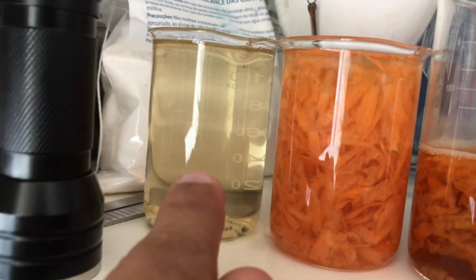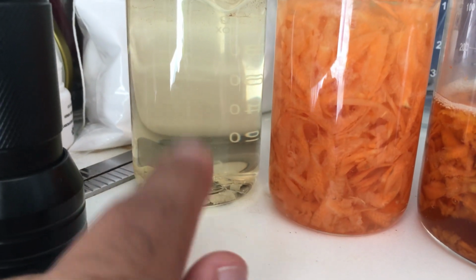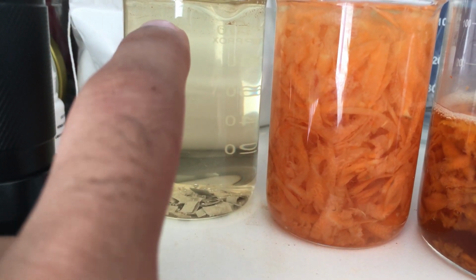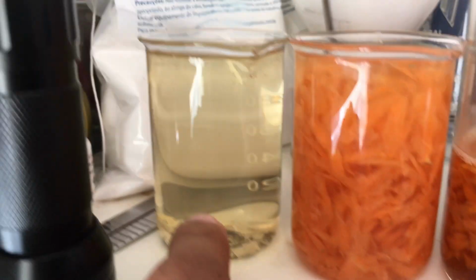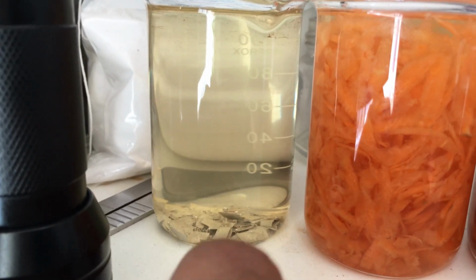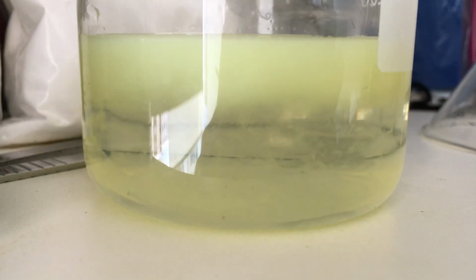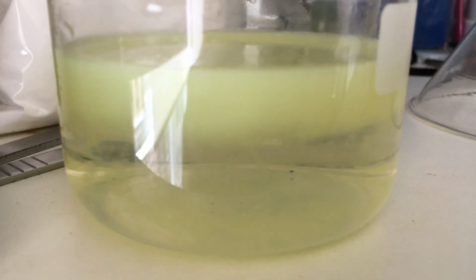With the magnesium strips, I'll filter it out once, just to filter out the magnesium strips, and then I'll add approximately 30 grams of sodium chloride so that the harmalines precipitate out. This is known as the Mansaki technique. It's the name of the scientist, and it works out to prevent the magnesium from precipitating out. So here is the salt saturated solution of the magnesium strips.